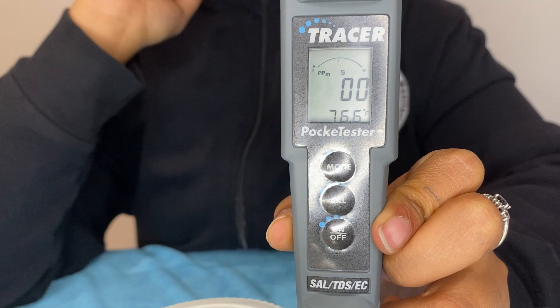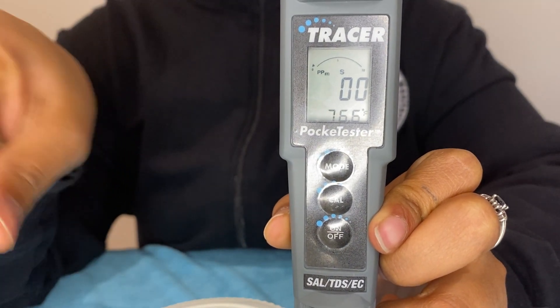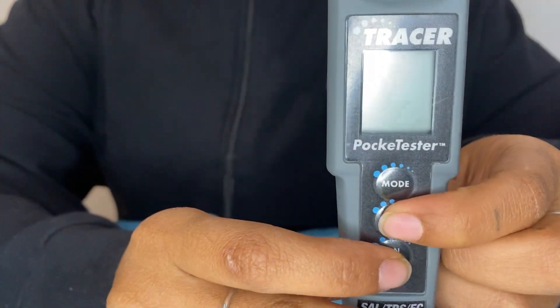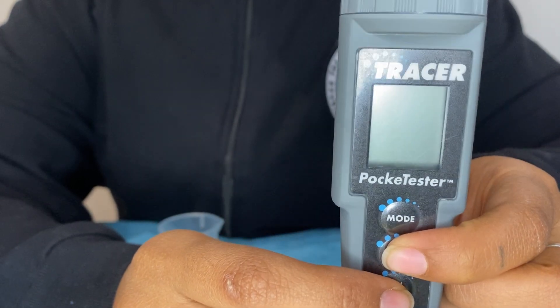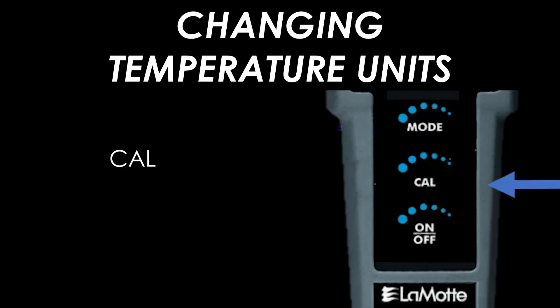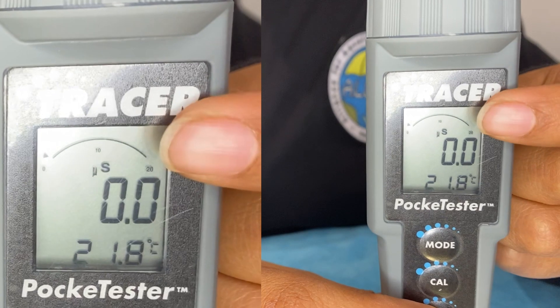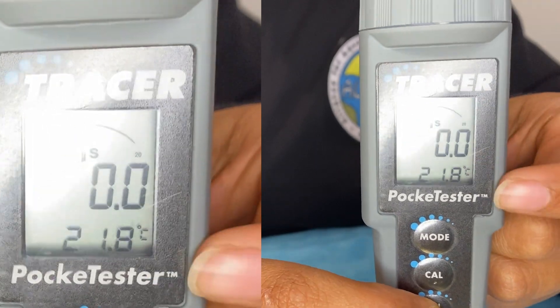The temperature will be displayed at the bottom of the screen. If the units are in Fahrenheit and you want to switch to Celsius, or vice versa, press and hold the CAL button and then quickly turn the meter on with the on/off button. This should switch your unit between Celsius and Fahrenheit as you desire.